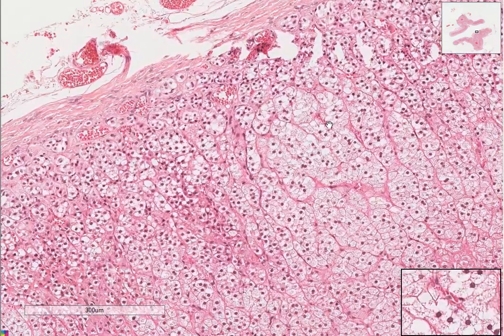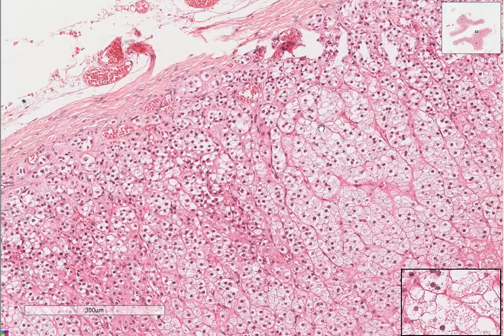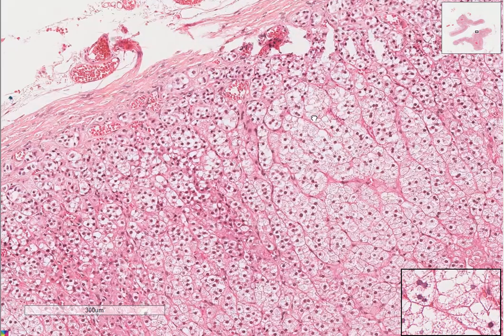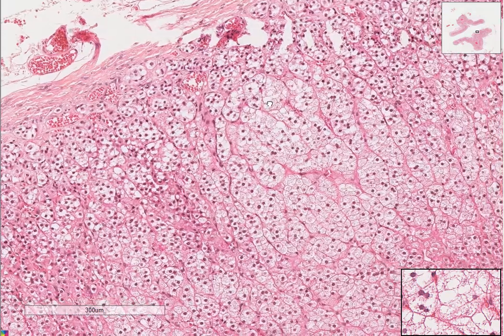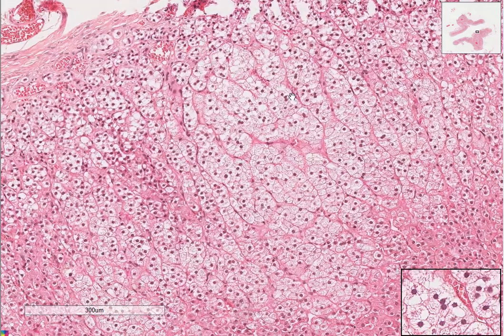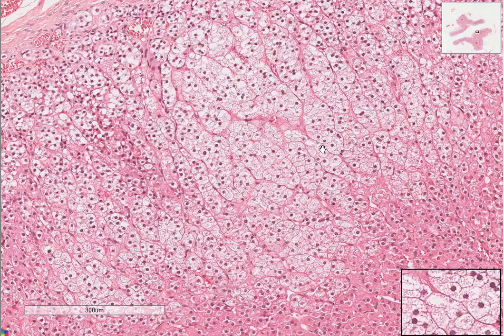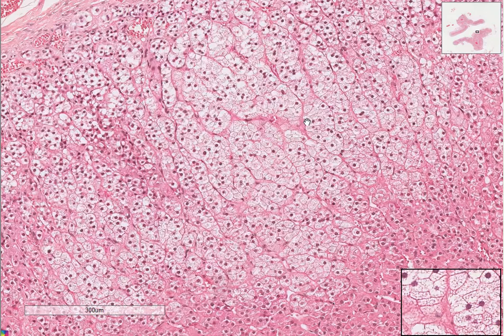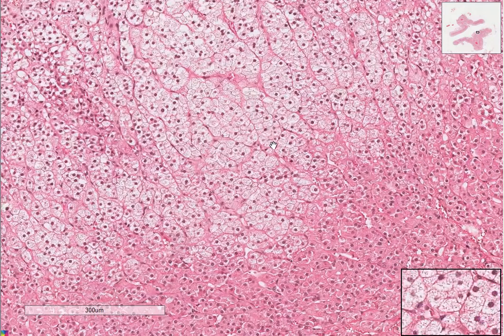And this is where you get your mineralocorticoid secretion, like aldosterone, which acts, if you remember, on the distal convoluted tubules of the kidney and helps us with total body water volume and your sodium levels within the body. And deep to the zona glomerulosa, we've got the zona fasciculata. I call this the zone of fascicles, but not really fascicles. It's just the cellular arrangement is in fascicles, as you can see here, as we go deep here.